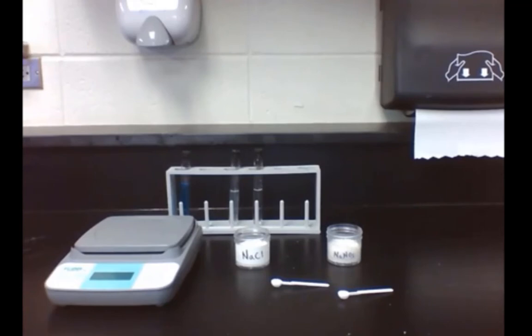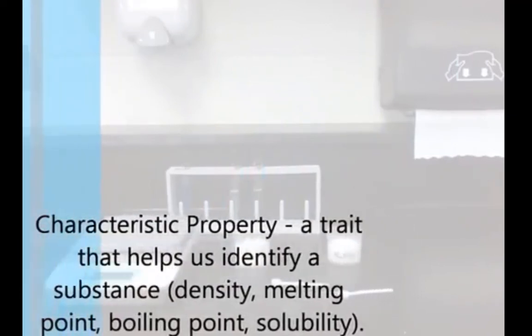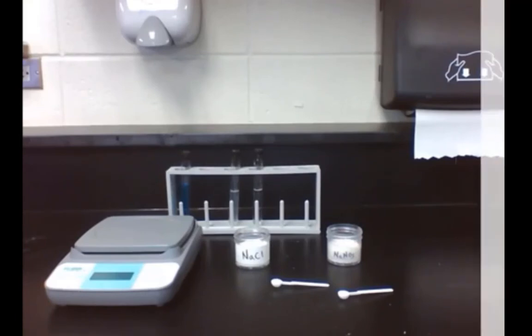For example, if we had spilled some salt while scooping it into the test tube, our data would not be accurate. Or if we kept scooping salt into the solvent before the solute completely dissolved, we would not have made true saturated solutions.